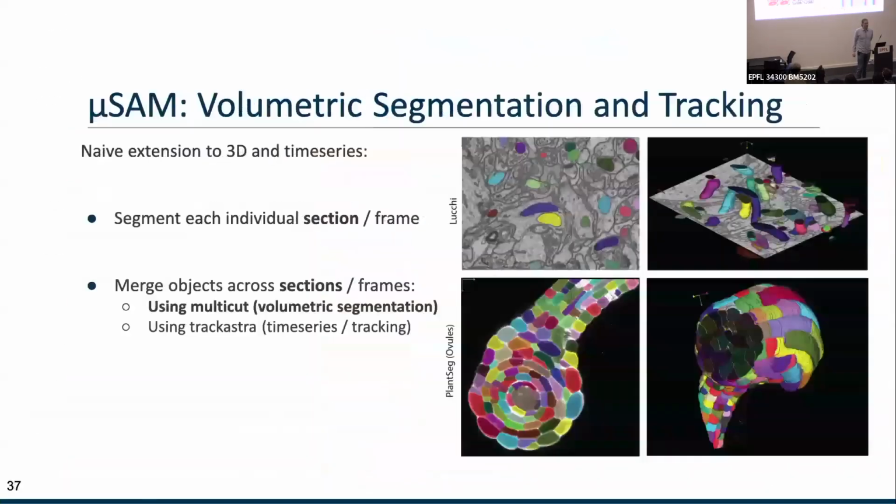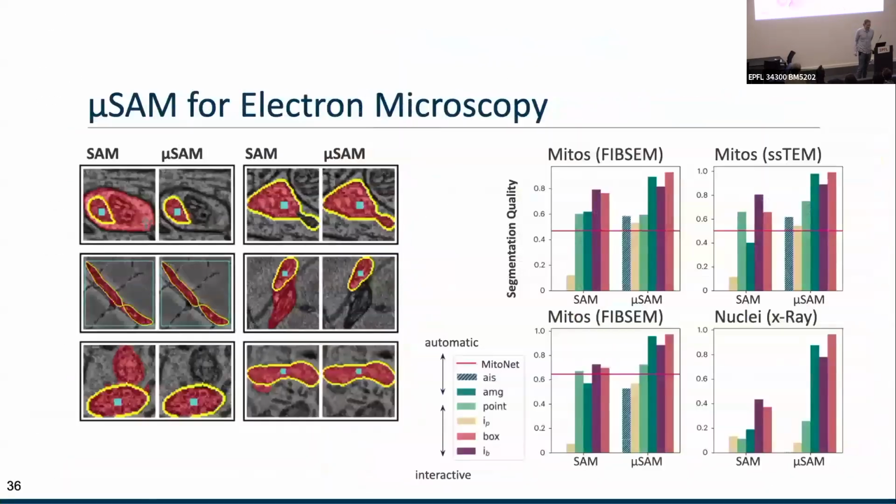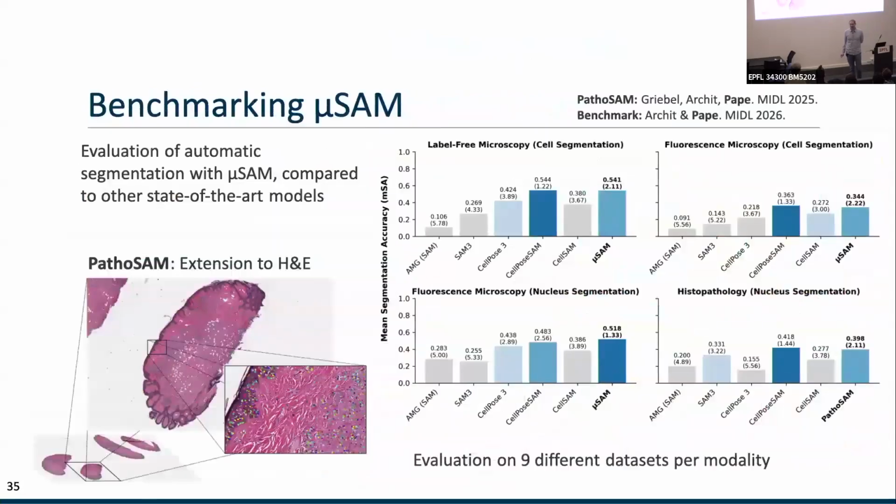Yeah, this is actually a good question. It is a bit of, let me go to this slide for this, a problem of these metrics. So there's a lot of different ways to measure this. Fundamentally, they all share a similar idea, right? So you have the ground truth mask, the annotation from a human, and then you check your predicted masks and how well they match.